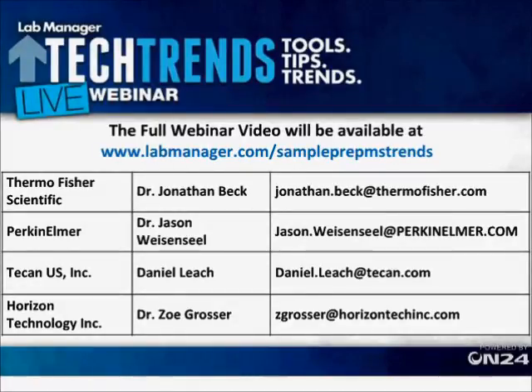It was mentioned that the method utilized very small sample volumes. Do you see this as being a current trend for sample prep? And how is that affecting the approaches taken? Yeah, this is Jonathan. I'd just like to add that with respect to some of the food and water samples, smaller samples can be advantageous to save on things such as shipping costs as well as storage of the samples. If you can go from a 1 liter bottle down to a 10 milliliter vial, you need a lot less room to store those samples in your laboratory until you can run them. And at the same time, it's a lot cheaper to FedEx smaller volumes than it is large bottles. So that's another consideration.